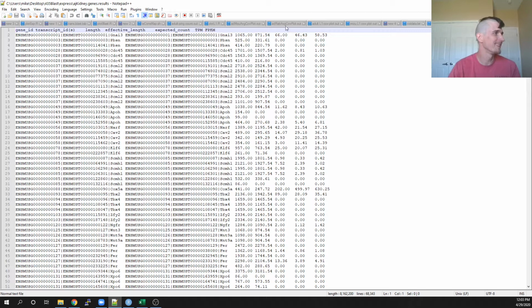So it's this third column, 66, 0, 0, 2, 0, 0, blah, blah, blah. It's weird that RSEM gives decimal values to this expected read count. Not entirely sure why it gives us a decimal whenever read counts should be whole numbers. And I can tell you for sure DESeq will complain if you give it a data matrix that just has decimals in it. It will throw an error.